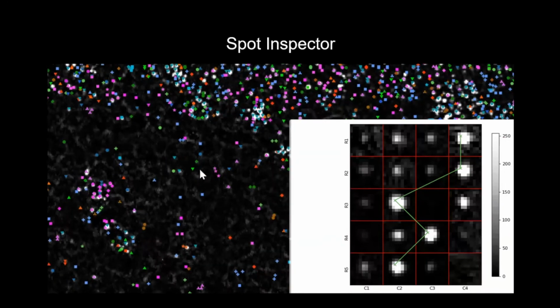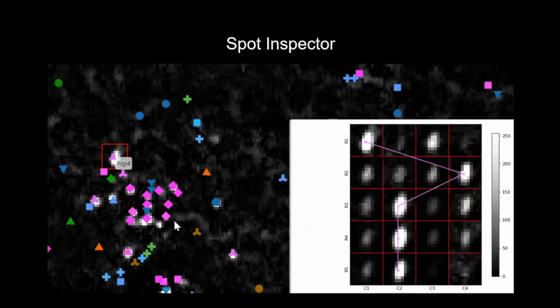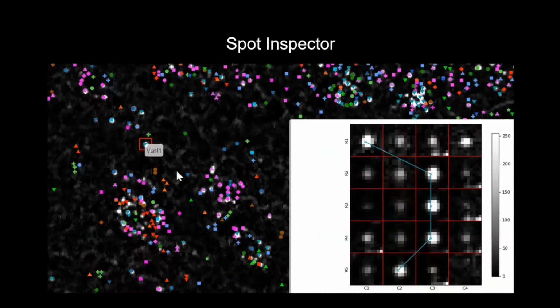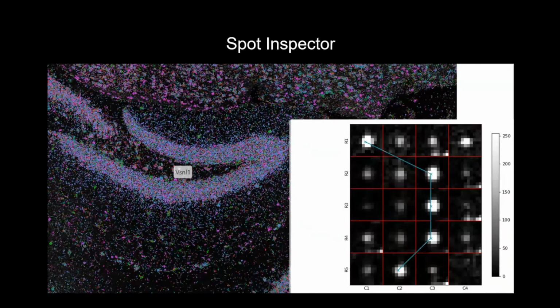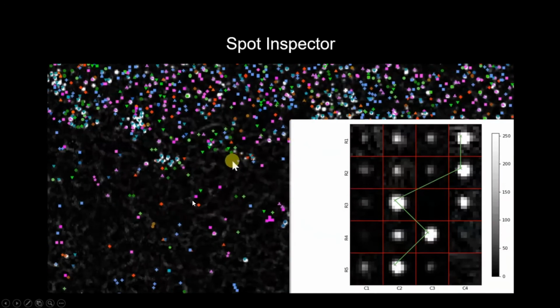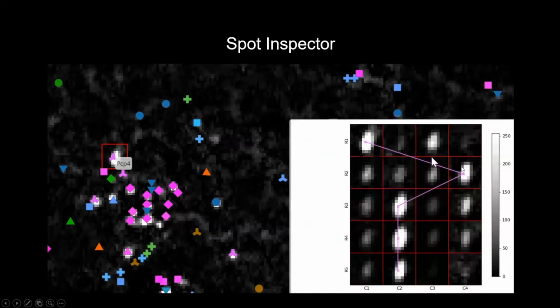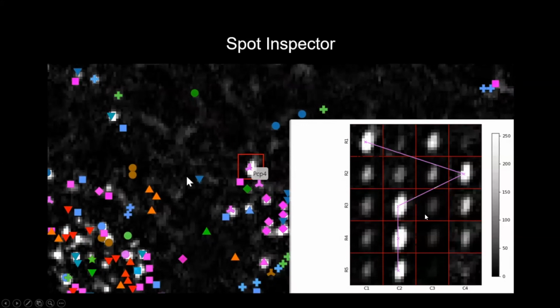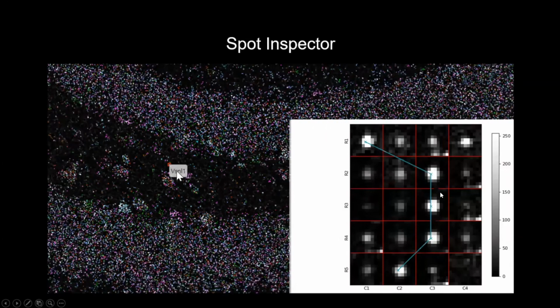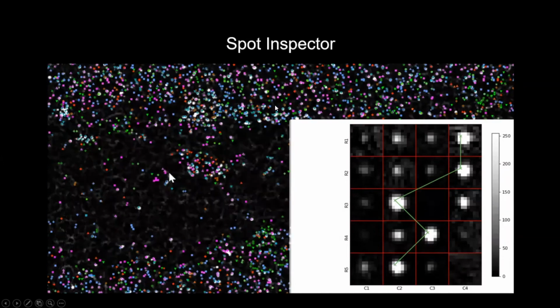And then the last one is one that we will actually test during the lab today. It's when you do in situ sequencing decoding, then you want to know if the spots you find are actually good in the raw data, so in the original images, by looking at the intensity of the pixels in each round and channel. So for example, here we have 5 rounds and 4 channels, and you can see how the different points in the tissue were decoded. So if you click on this one, you will see that it will follow the spots in each round following a code book, and then you can decide if it's a bug or if it makes sense, and so on.